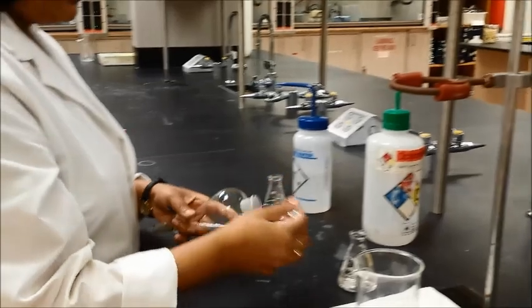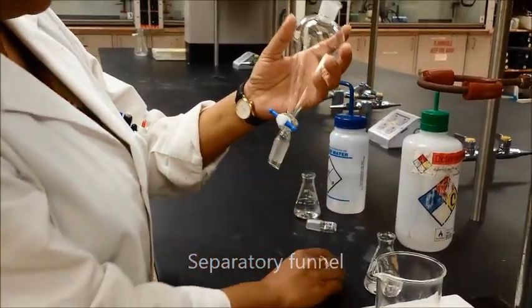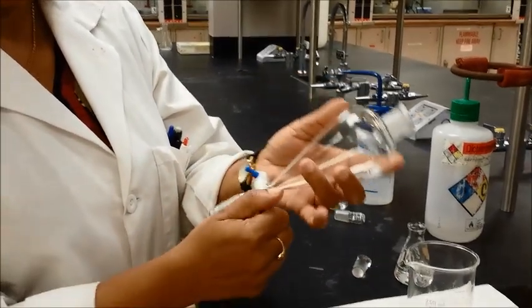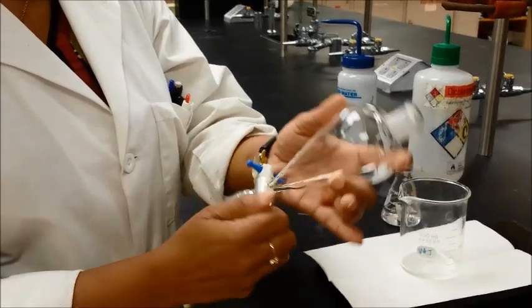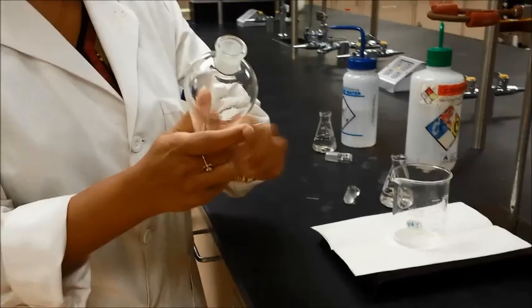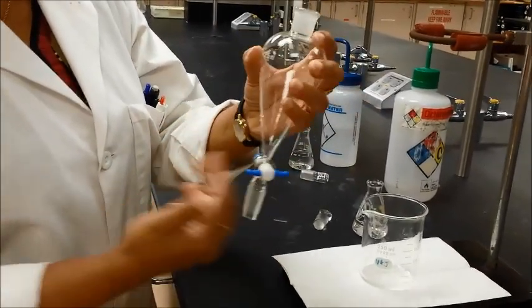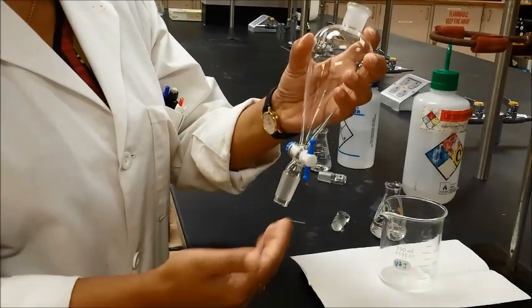This is what a separatory funnel looks like. It's where you have a bulb like this and then you have this stopper. The stopper here is just like what you may have seen in the burets, which means you can open it up and clean it, and you also need to tighten it so that you can move it freely. It shouldn't be so tight that you can't move it. Remember, this is open, this is closed — if it's perpendicular, it's closed, and if it is parallel, then it's open.